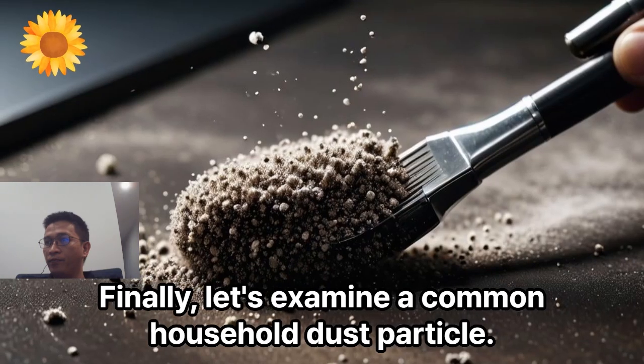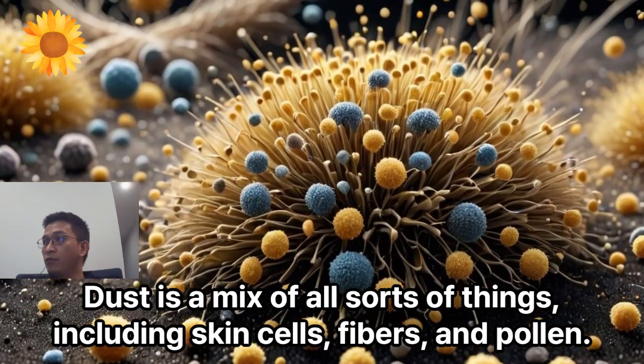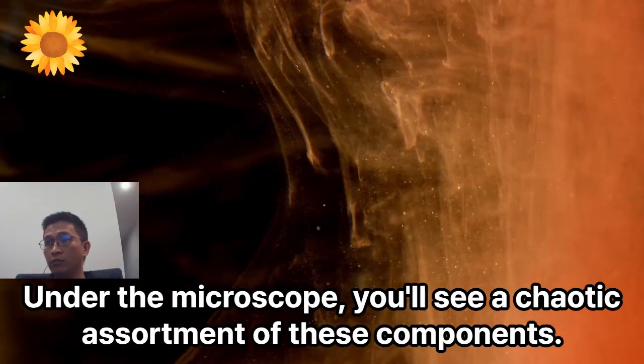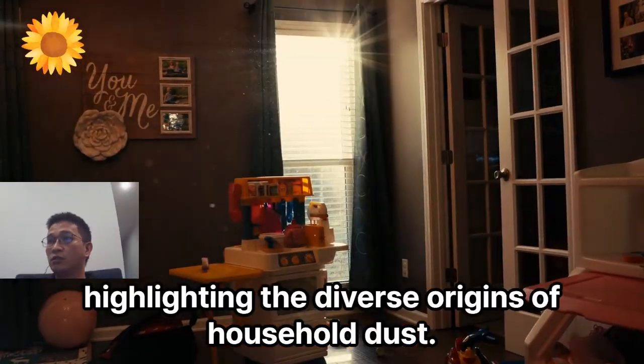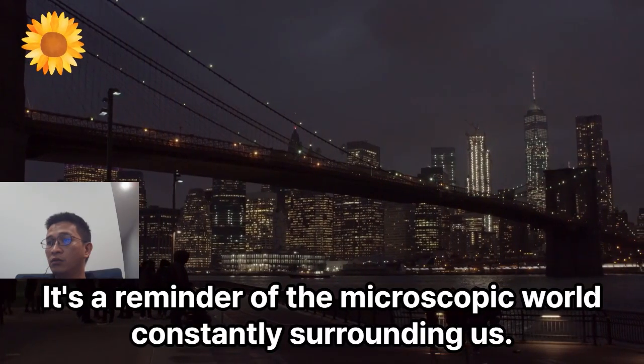Finally, let's examine a common household dust particle. Dust is a mix of all sorts of things, including skin cells, fibers, and pollen. Under the microscope, you'll see a chaotic assortment of these components. The shapes and sizes vary wildly, highlighting the diverse origins of household dust. It's a reminder of the microscopic world constantly surrounding us.